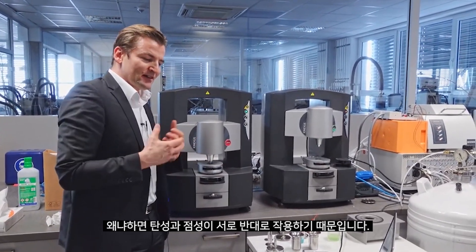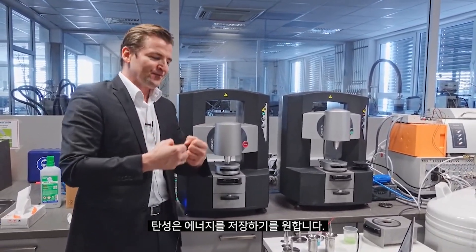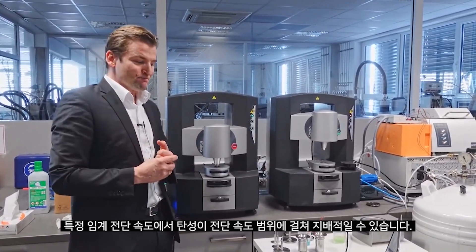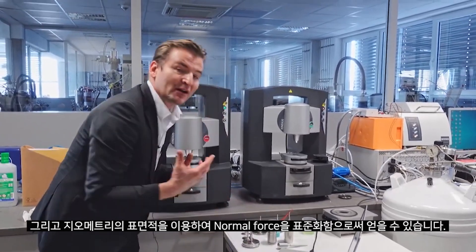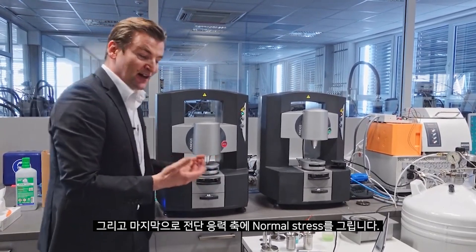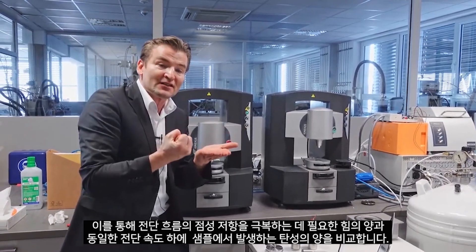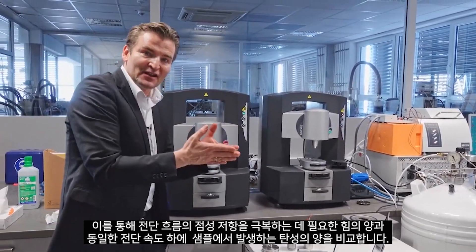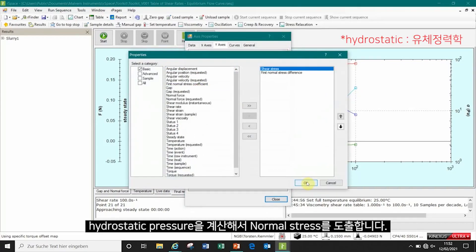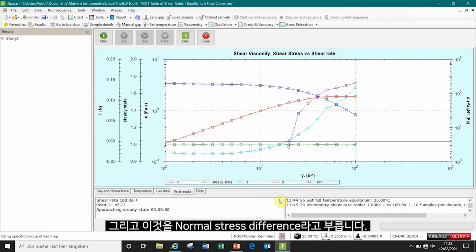It's quite the opposite effect, and that's interesting because elasticity and viscosity are acting against each other. Elasticity wants to store energy; viscosity wants to dissipate energy, and at a certain critical shear rate elasticity can become dominant. This is analyzed by normalizing the normal force with the surface area of our geometry — called normal stress — and we plot that onto our shear stress axis to compare the viscous resistance in shear flow with the elasticity arising at the same shear rate. We also calculate and remove the hydrostatic pressure, which is why it is called the normal stress difference.